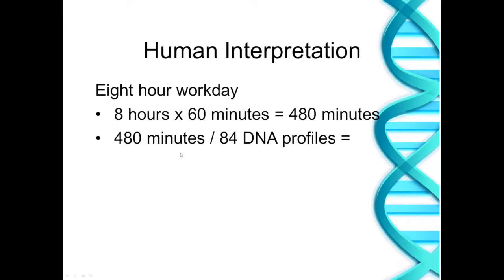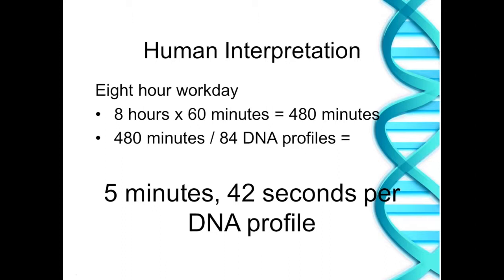If we're considering 84 profiles on a plate, between 80 and 90, so let's just say 84, that's a nice even number, and 480 minutes in a workday, we're looking at about 6 minutes per DNA profile roughly for interpretation. So if you do this 8 hours straight, no bathroom breaks, no answering emails, no phone calls, could you do 84 profiles? Could you interpret a whole plate in an entire day?